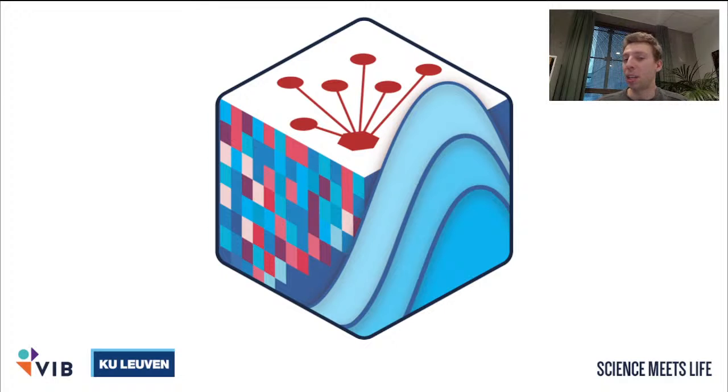Like I was showing in the tutorial, there also for some cell barcodes we didn't have a label. These are the cell barcodes that we filtered out in the RNA-seq part. This step is only used to generate the pseudobulk profiles, so it's fine to only use a subset of barcodes for this step. Later on in the QC is where the actual barcode selection will occur for the single cell ATAC-seq side. But for cell type annotation, it's not needed to have annotation for each cell barcode.